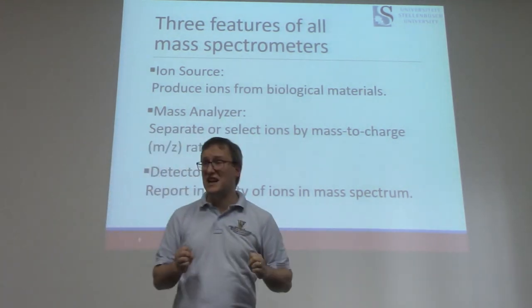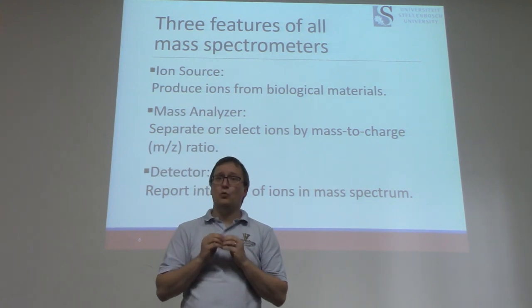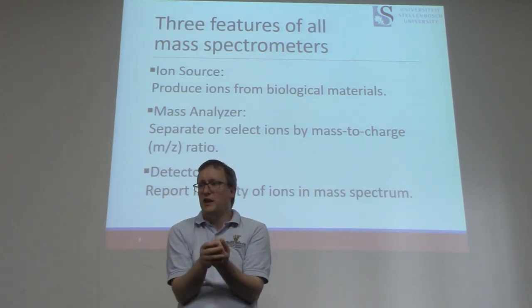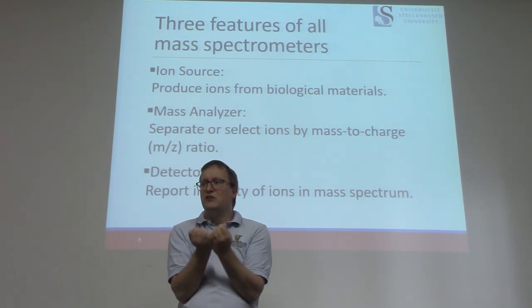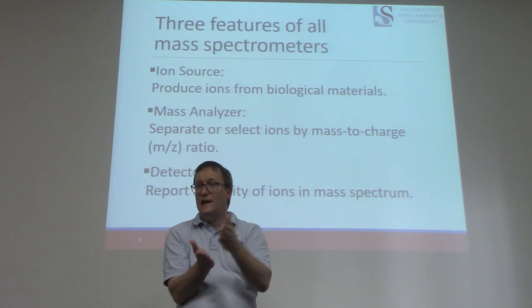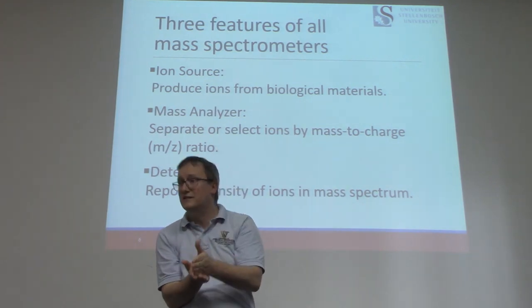And finally, we've got the detector. Once you have created a set of ions and you need to understand what they are, you're going to create a spectrum that reflects their mass-to-charge values on the x-axis and their intensity values on the y-axis.